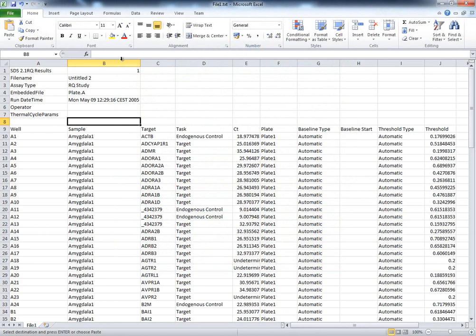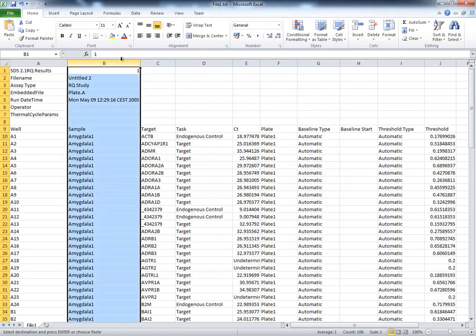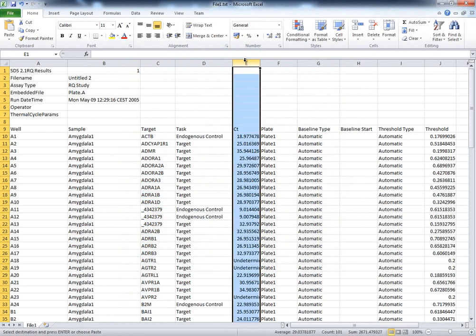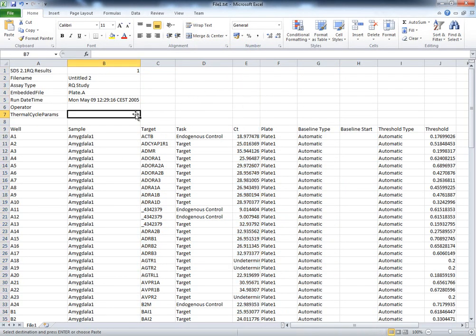StatMiner reads text data files, providing they contain a minimum set of information, including sample names, target IDs, and the CT values. Each of them should be organized independently by category.